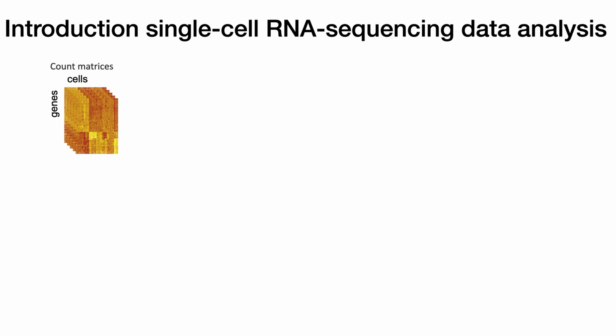Again, dimension 30,000 by 3,000 is huge, and you don't want to check every line one by one, but you would like to discover patterns in the data set. So in order to discover meaningful patterns, you have to go through the process of pre-processing, filtering your data, normalizing, and let me show you a couple of steps that you have to do here.